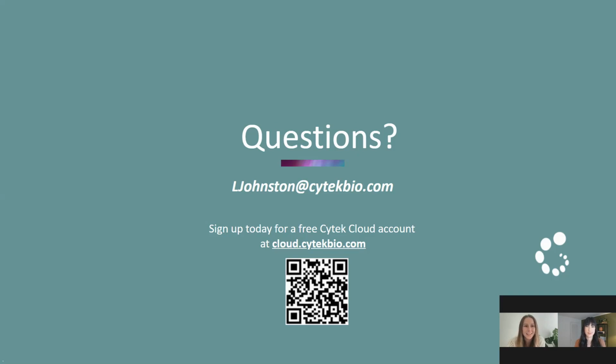So a question here is, do you need to do a panel optimization experiment if you have a small panel? Yeah, so it's always a good idea to test out your panel before you do a real experiment with some very precious samples. But certainly if you have a very small panel, then it may not be quite as critical. Whereas if you have a larger panel, then it's definitely very critical to do that panel optimization experiment before you run any sort of real experiment.